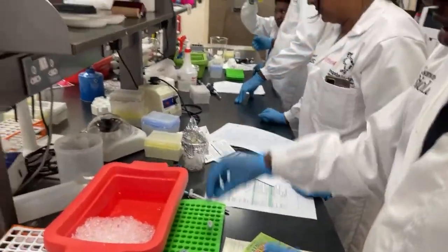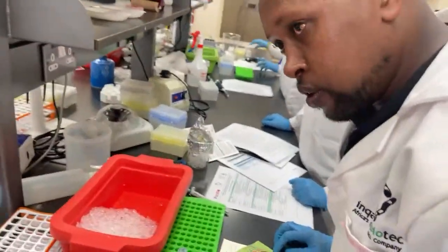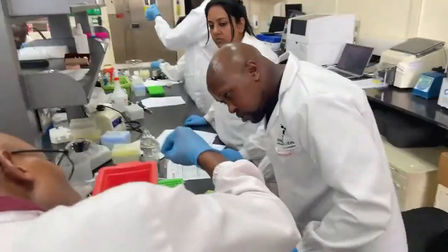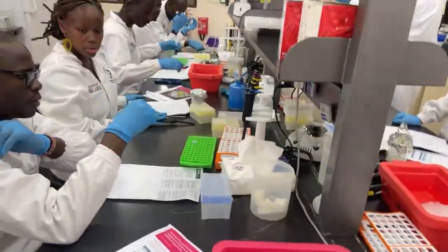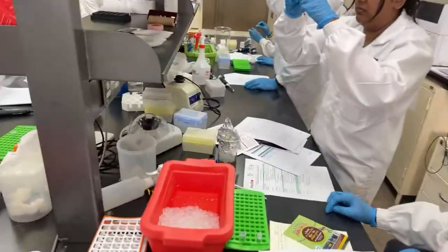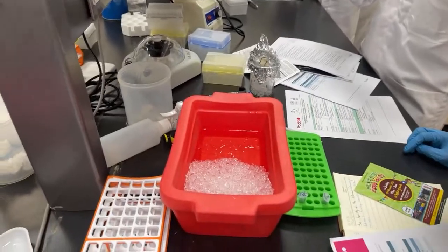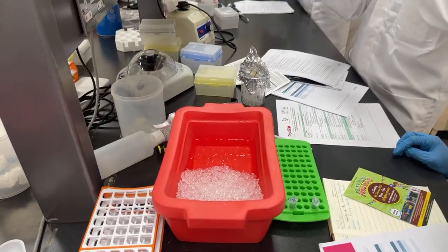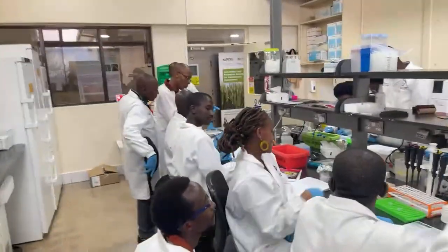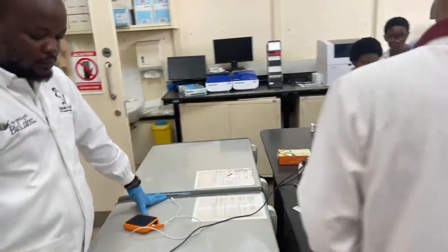So the nano bit should be inside the EB, because it's floating out. It should be inside. It's 50, right? It's 75. It's supposed to be 75. Then this must be in the, otherwise it's not going to. You can give it a quick spin. Like this. But you will go down the sides of the tube.